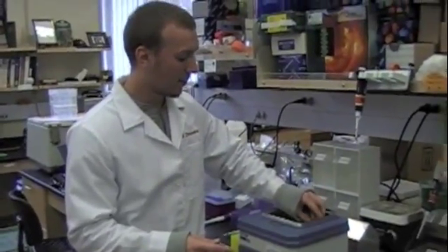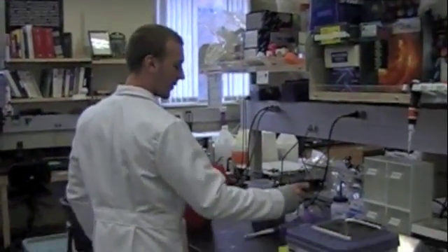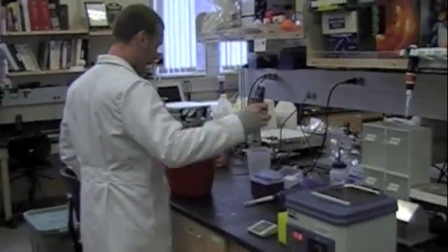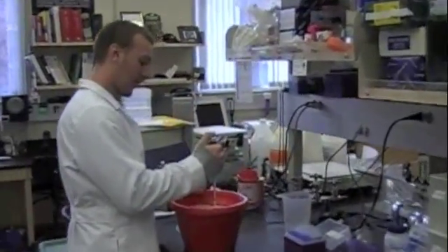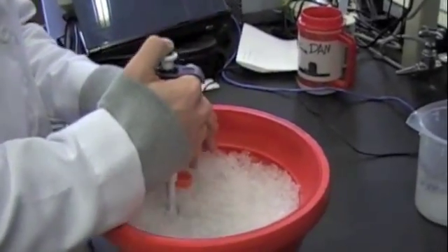So now with all these components prepared, we can start our transformation. The first step in transformation is to pipette your competent cells from the ice into your 50 ml falcon tube. Simply pipette your cells into the falcon tube.